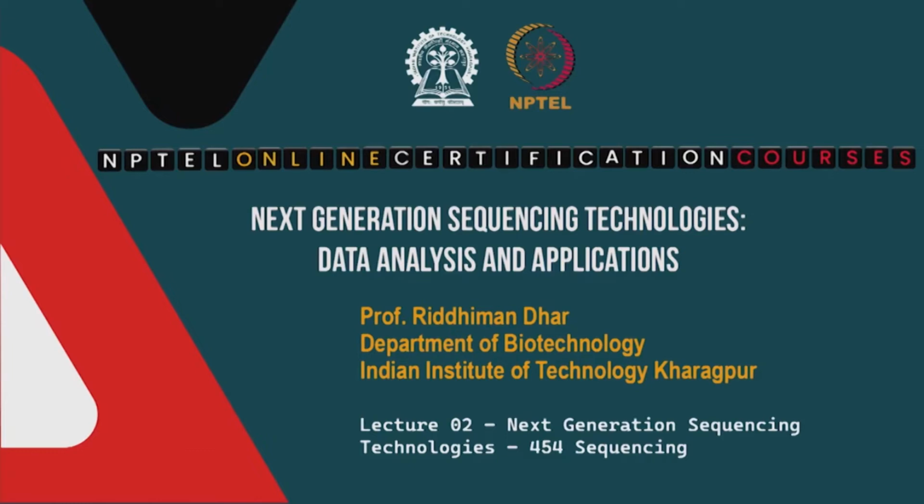Good day everyone, welcome to the course on next generation sequencing technologies, data analysis and applications. In the last class we talked about next generation sequencing, and from this class we will now introduce the technologies themselves, and discuss how these technologies have accelerated the pace of genome sequencing and provided high throughput sequencing. In this class we will talk about one of the first next generation sequencing technologies, which is 454 sequencing. So, let us start.